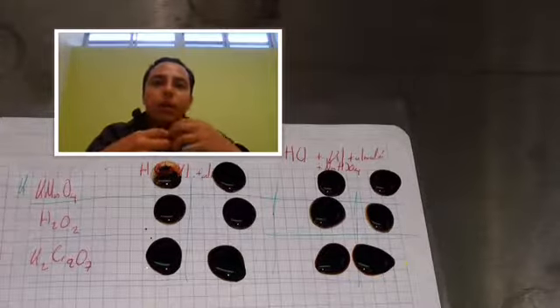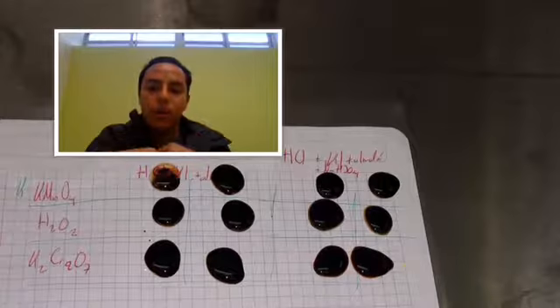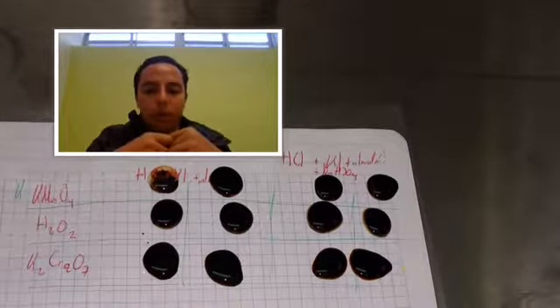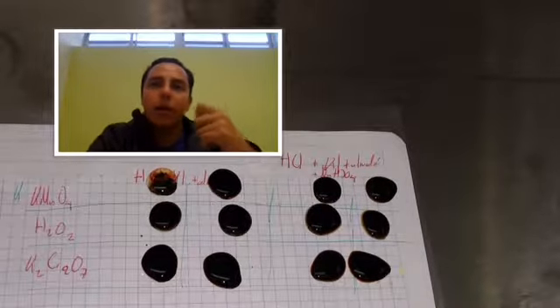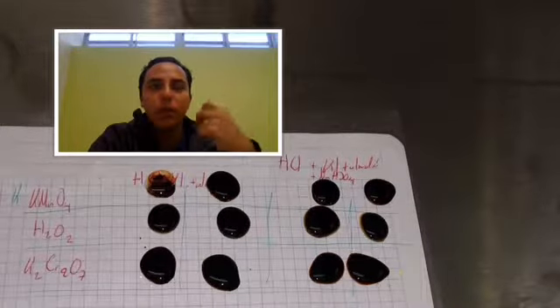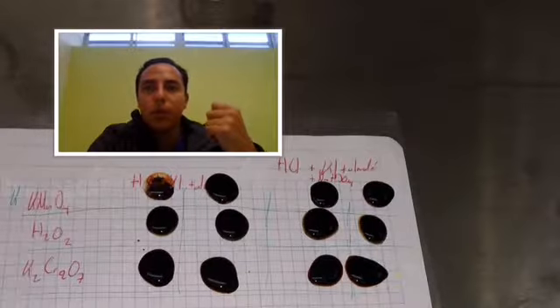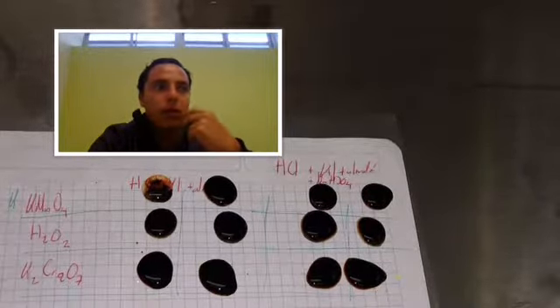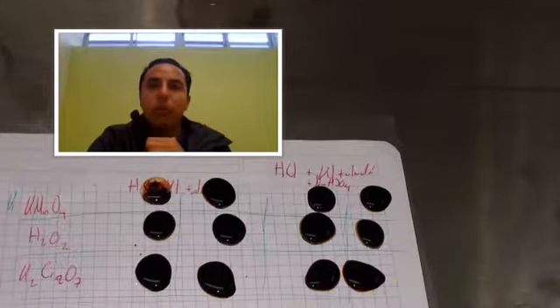Well, also there are several variations of these equations of the clock reaction, and the time is different because this depends on the concentration of the iodide that we put in the reaction, and also the solution of sodium bisulfite that we also add to the reaction.